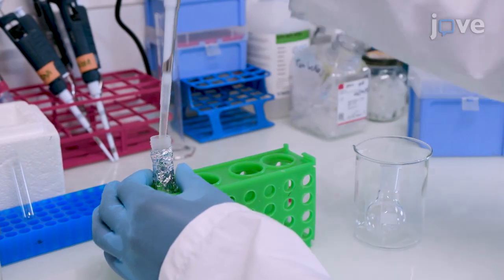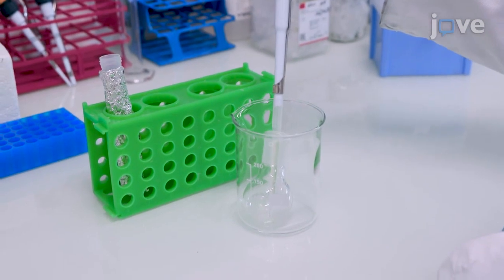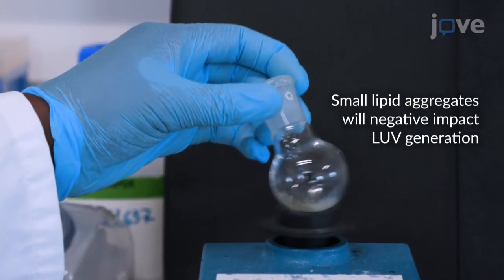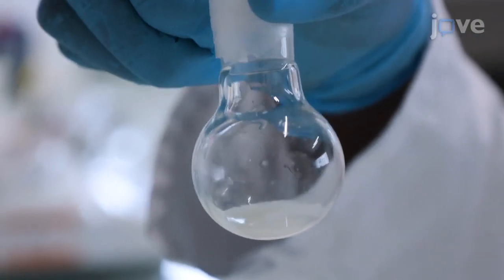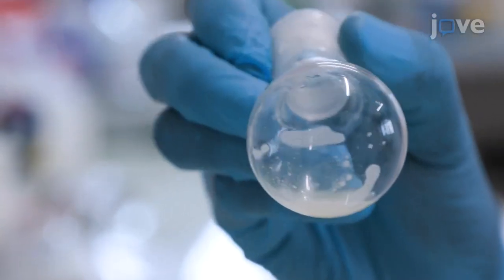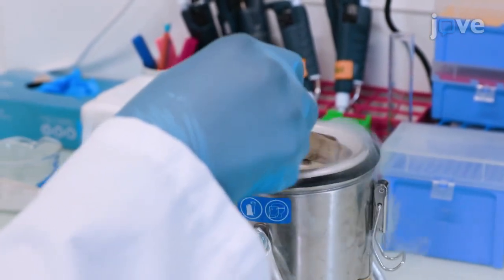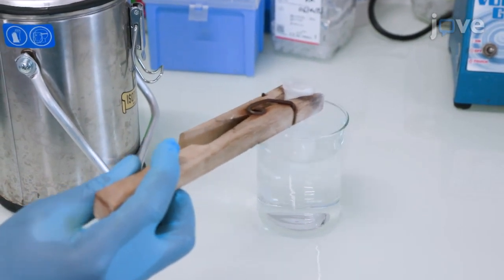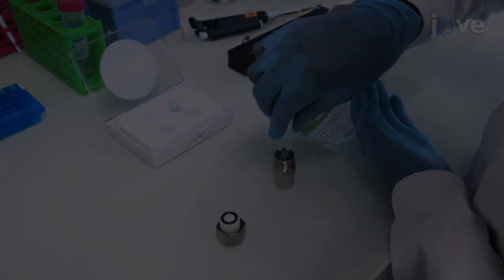To reconstitute the multilamellar vesicles, resuspend the dried lipid film with 1 milliliter of lipid hydration solution and vortex thoroughly until the dried lipid film has dissolved. After confirming that all of the lipid has been incorporated and that no film is left on the sides of the flask, freeze and thaw the vesicles 5 times for 30 seconds in liquid nitrogen and 2 minutes in a 30-degree water bath per cycle. To prepare the lipid extruder, insert 2 HEPES buffer-treated filters.